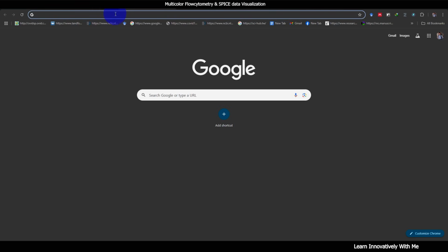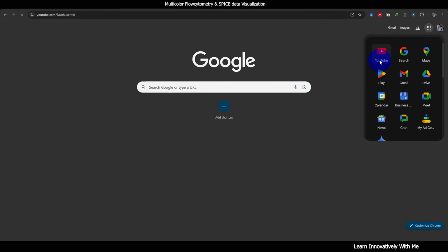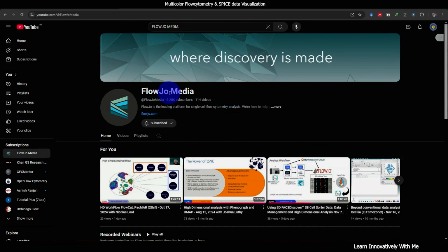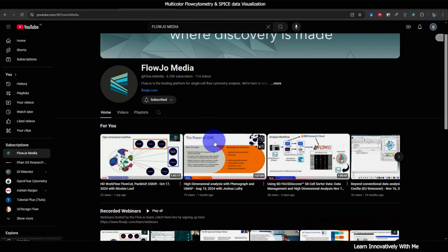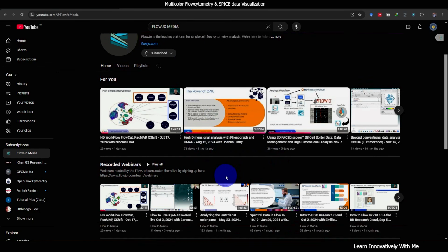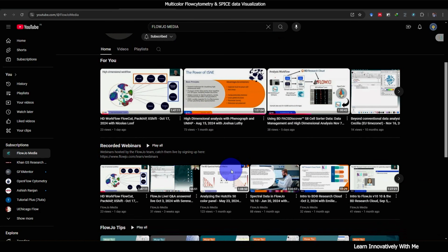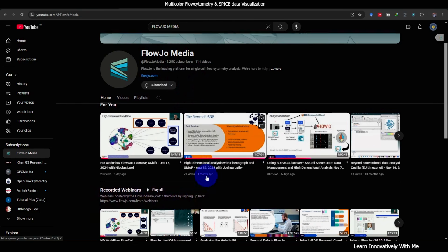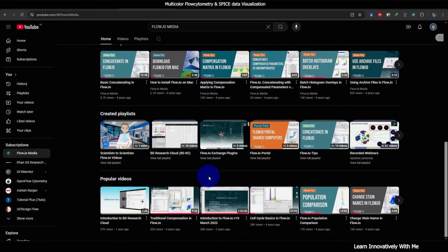The other very important source I want to show you, so that you can visit it and get detailed and extensive information about flow cytometry experiment data analysis, is FlowJo Media. This is a very important YouTube platform to learn data analysis of flow cytometry experiments. You can get each and every piece of information about the analysis. So I highly recommend that if you are doing flow cytometry experiments and data analysis using FlowJo, you definitely visit FlowJo Media to learn the data analysis from there.